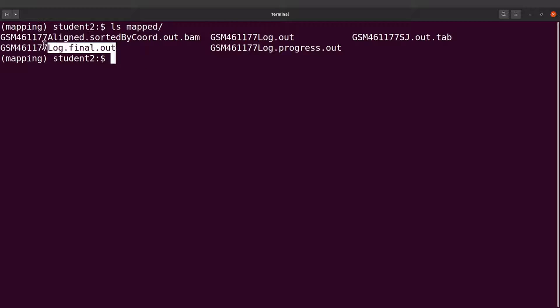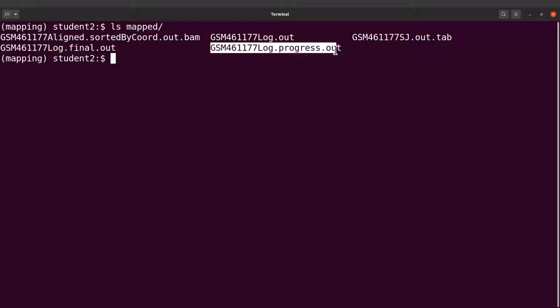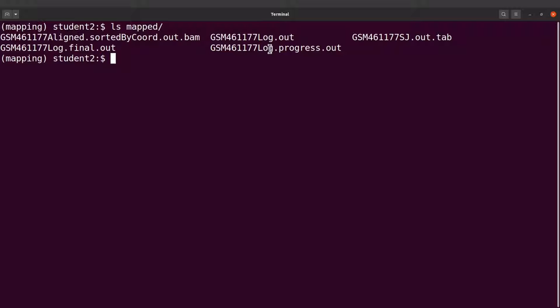With the log files, this one contains mapping statistics. This one is the main log file and it contains a lot of detailed information and this can be useful for troubleshooting and debugging. This one is a progress log file and this is where STAR writes the progress.